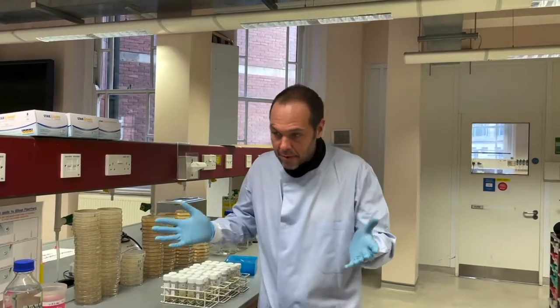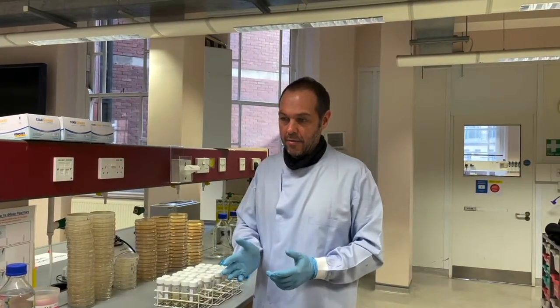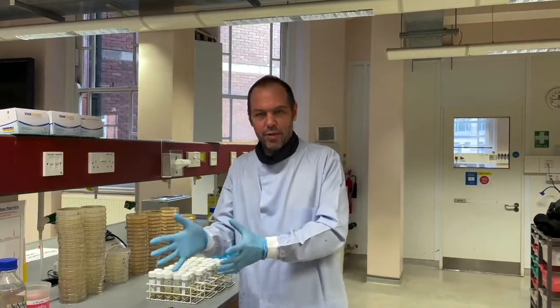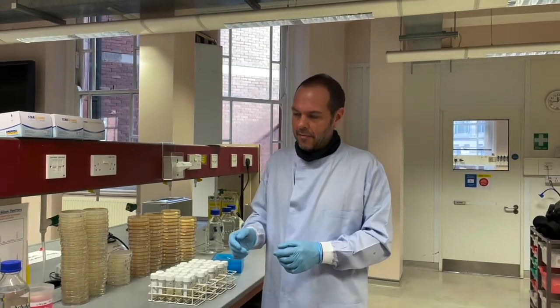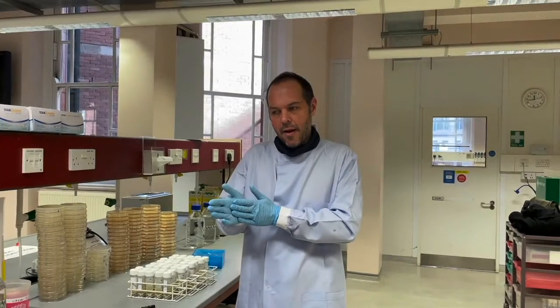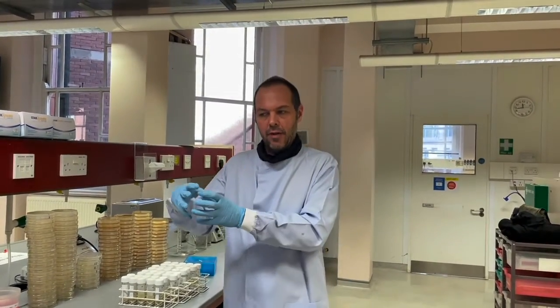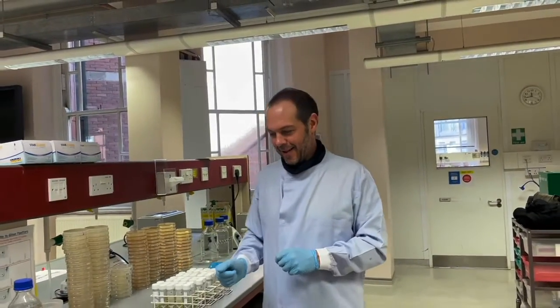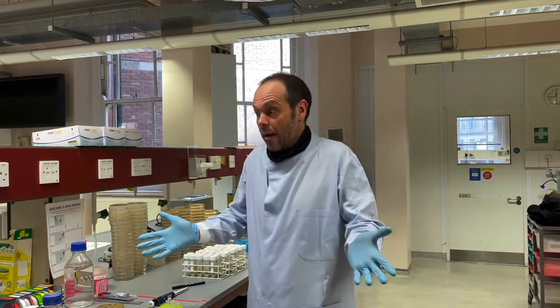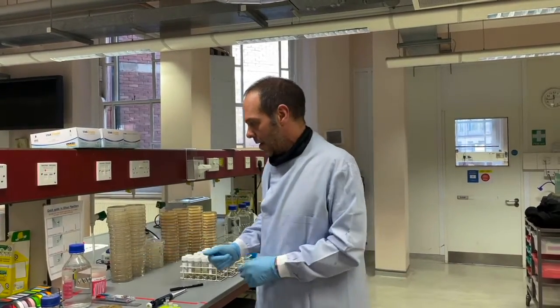The last form of dilution is not quantitative, but it's still very useful, and in certain contexts it's all you need. Let's say we've got a mixture of cells. If we don't care about the absolute density in the mixture, but only about the proportion, then we only need to get some single colonies out, and we can use that to determine the frequency of the two types. So I'm going to show you the simplest way to do that, which is used a lot in microbiology.